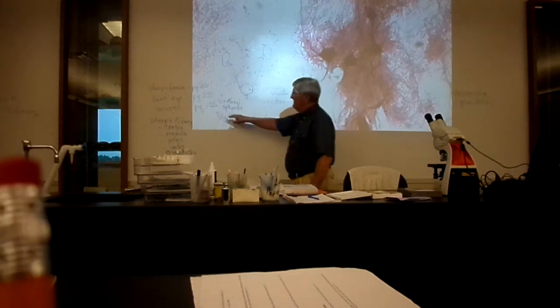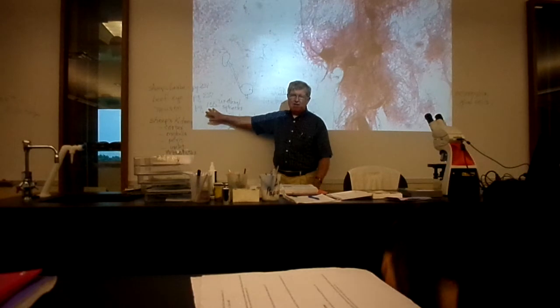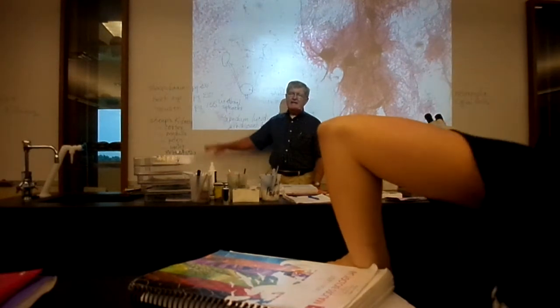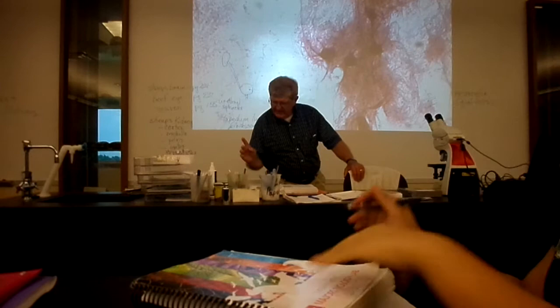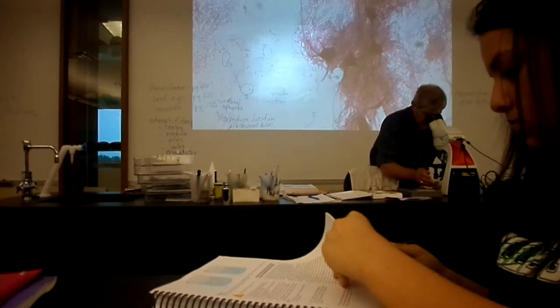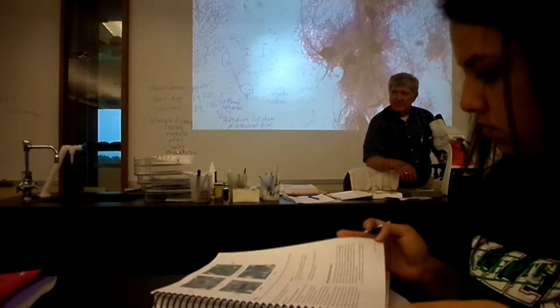So on page 155 of your lab manual, you have a diagram at the bottom of the page on the left side that has been labeled. And on the opposite side of the page, you have a photograph that has not been labeled. And they imply that there are 5 parts that you're supposed to label. You need to do so because these are parts you could be asked on lab exam 3, which is 3 weeks from today.